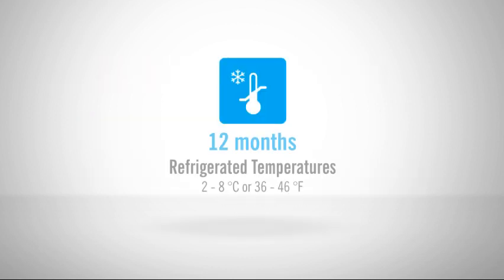Microsnap EB should be stored at 2-8 degrees Celsius. Test devices have a shelf life of 12 months. Be sure to check the expiration date on the bag and swab label before use.